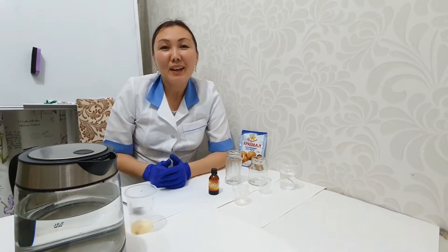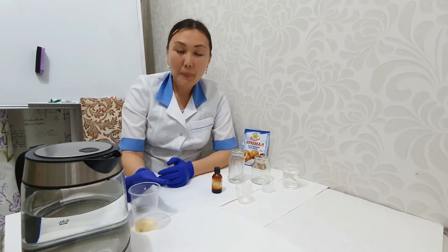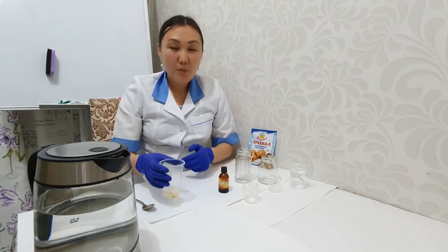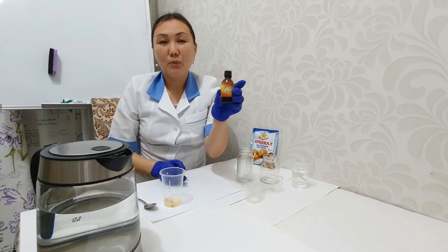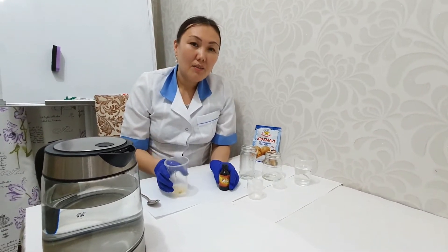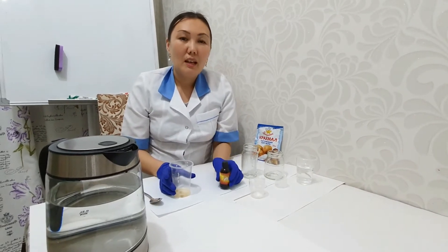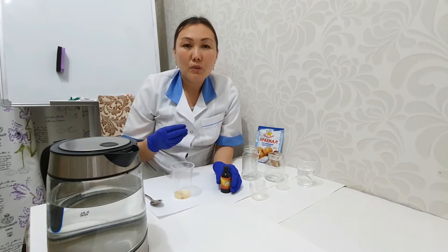Today we are going to learn how to determine vitamin C in lemon juice. I'm going to use iodine from the pharmacy because ascorbic acid, which is vitamin C, reacts with iodine. We will see the change in color — iodine from brownish color will change to colorless.